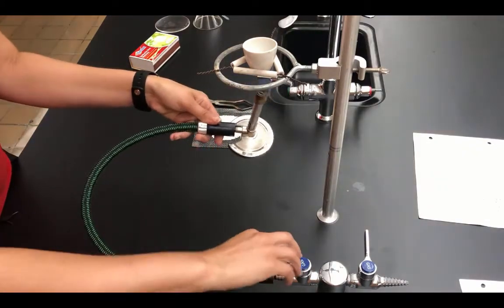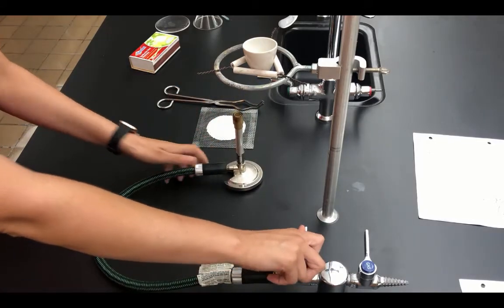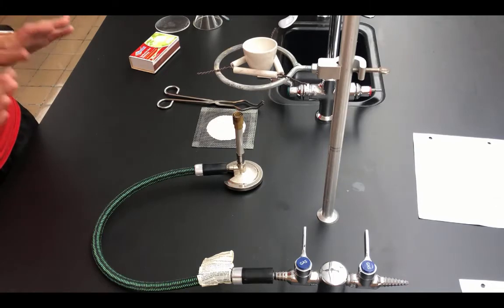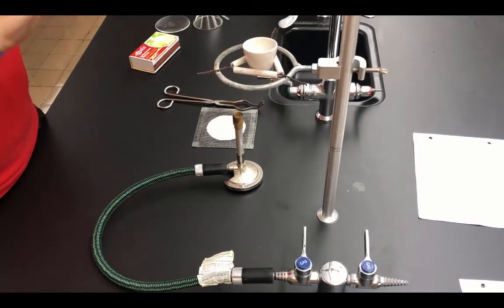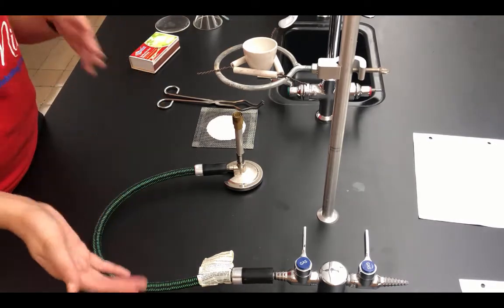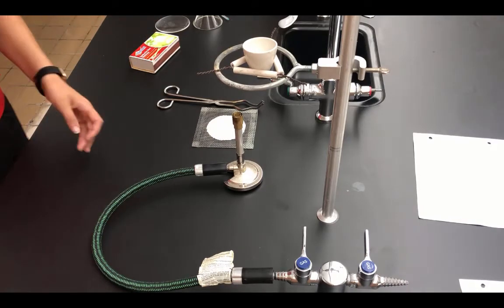After 1 minute, to turn off the Bunsen burner, we're just going to turn off the gas and set the Bunsen burner down. Now it says that we want to allow the crucible to cool to the touch. Do not touch the crucible right away. Let it sit there. We're going to let it cool down for quite a while. While we let it cool down, we'll look ahead and see what we can do to set up the next part of the lab.